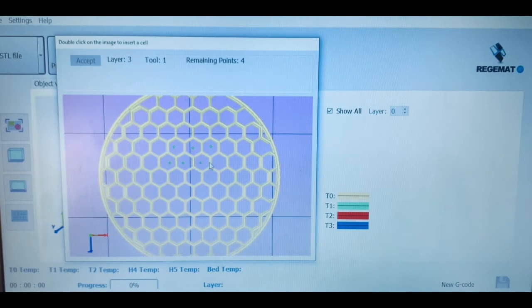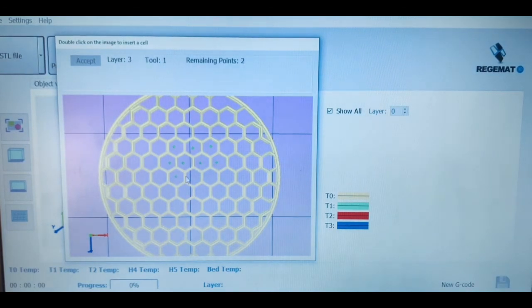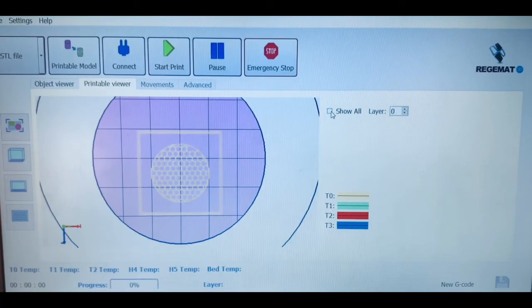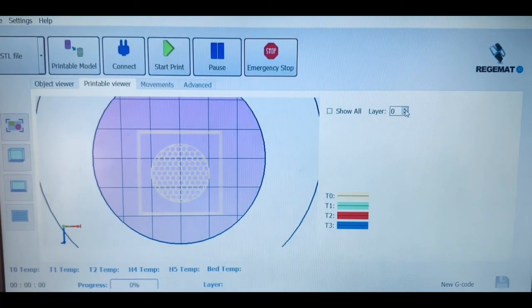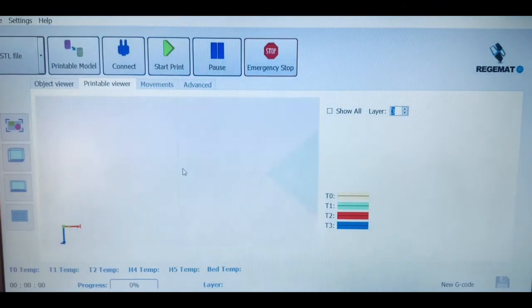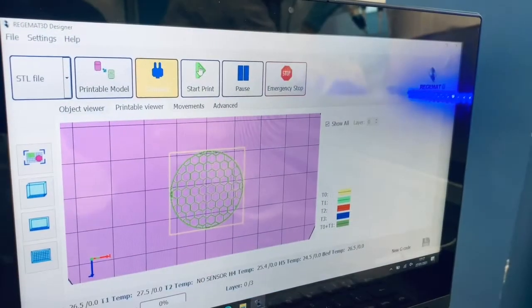Once we have a complete printable model, we can see a recreation with all the layers and the color of the tool that is going to be used, and then we can select which ones we want to see to then start to print.